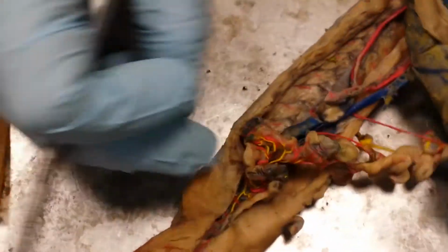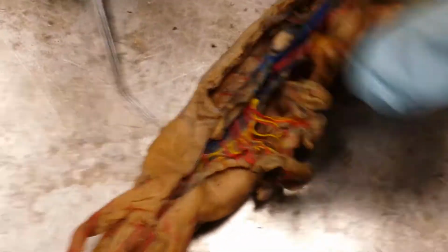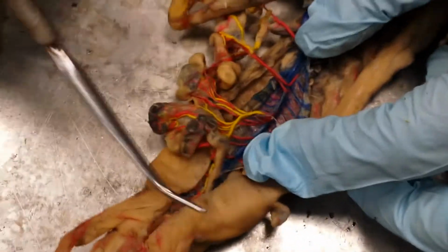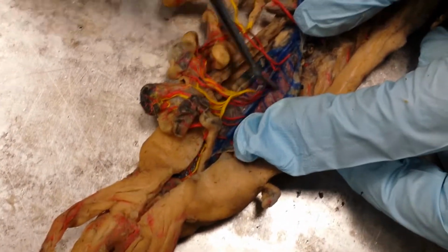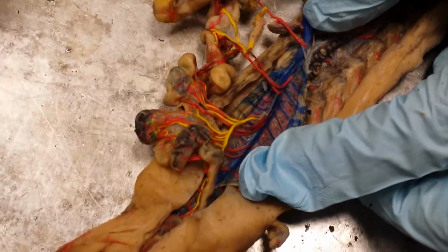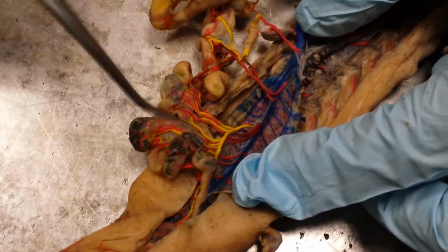Okay, so the other thing you want to know is that blood drains from this posterior portion of the salamander up through this big blue vein here. That's the post cava, posterior vena cava, inferior vena cava.